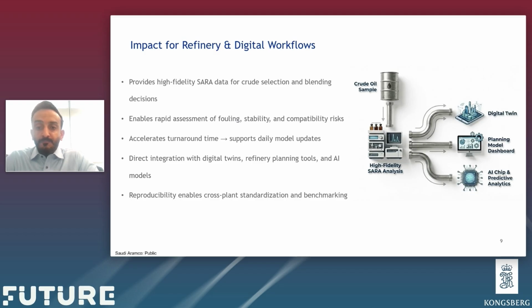One of the biggest advantages of this method is how directly it feeds into operational decision making. It is very reproducible, anyone can build it, and it is very quick. You get the results within 35 minutes.